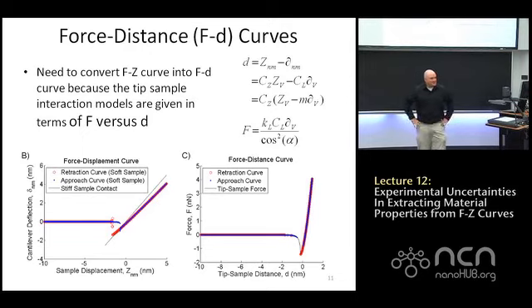Let's not look at the extreme cases. The question is, so far in the standard procedure, you don't have to worry about tip geometry. Yeah, so far tip geometry has not been taken into account, or it doesn't need to be. Doesn't need to be, yeah. So that is D. Any other questions?